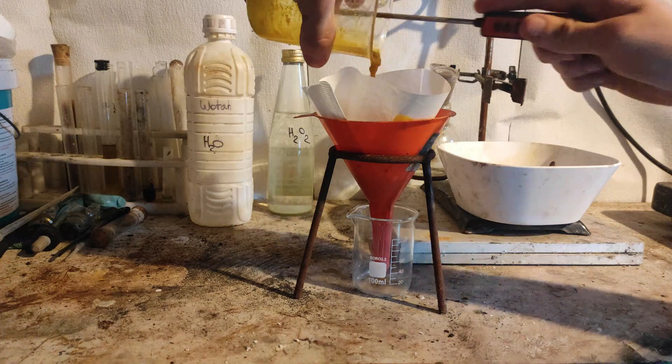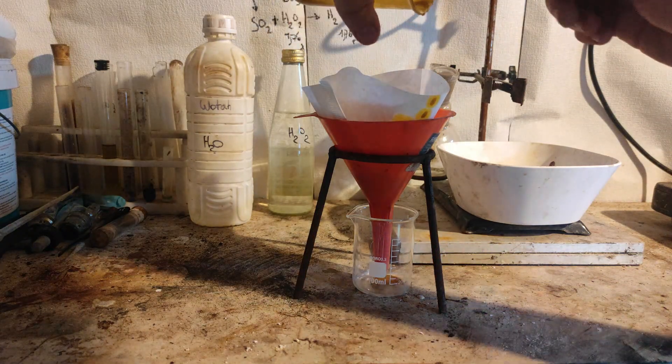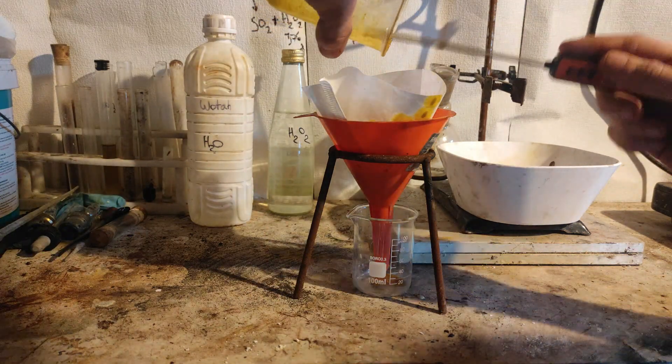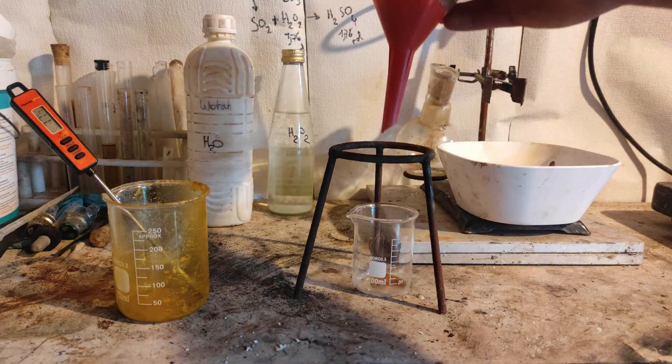Sadly, I had a problem with my dichromate and it was very contaminated with impurities. If you try to recreate this procedure, you should get bright orange crystals.